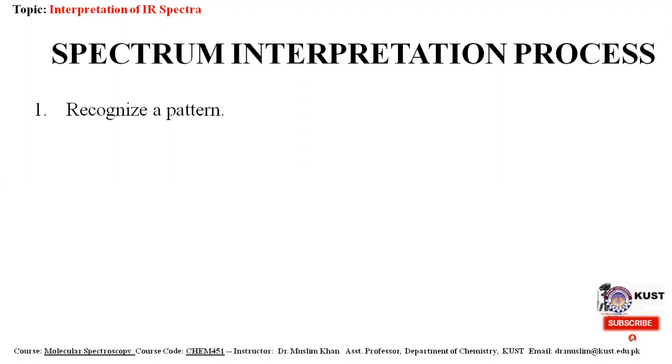So we are getting a piece of paper that is called spectra. So what type of information basically can we get from IR spectra? From where do we start to interpret or get this information?